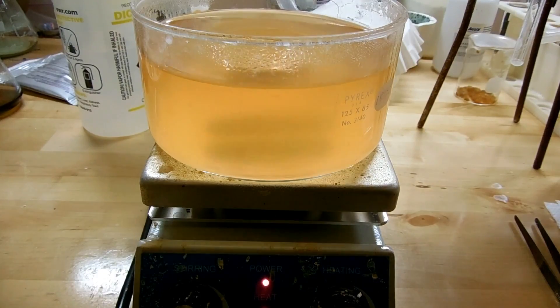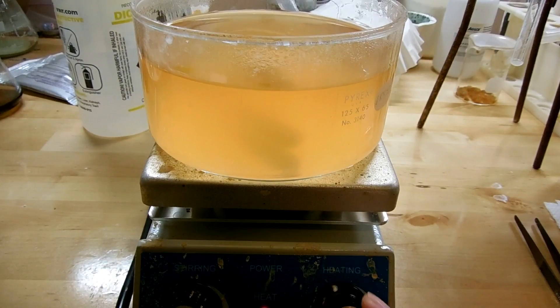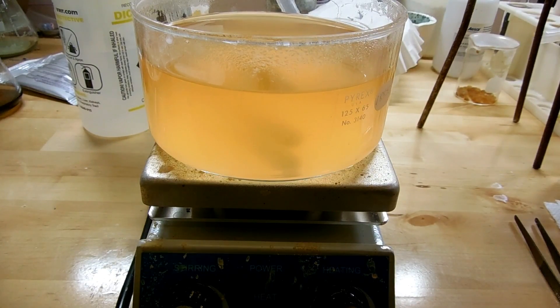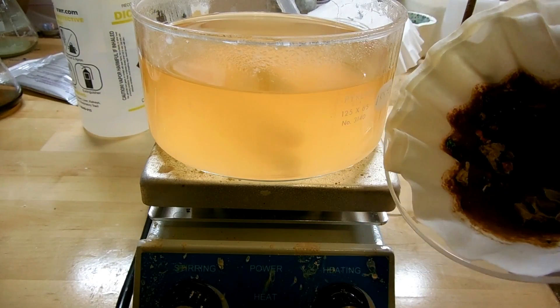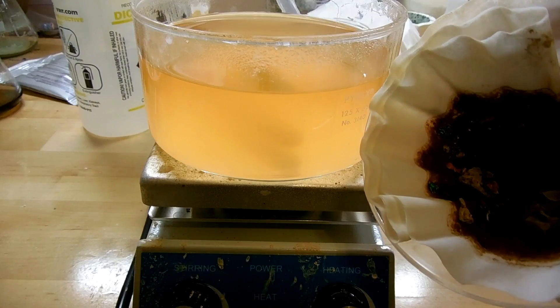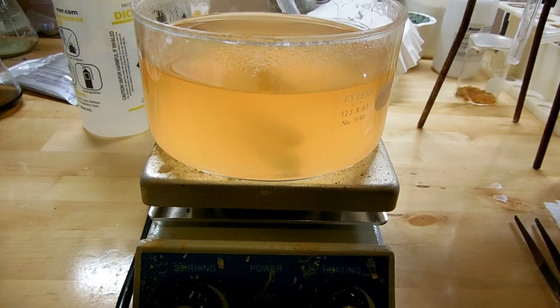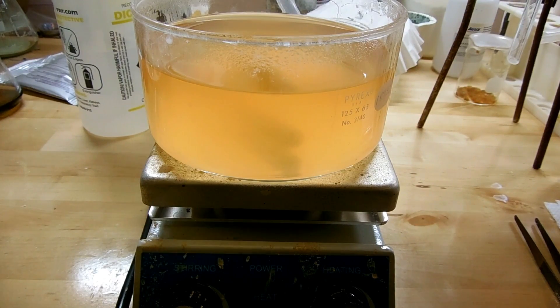Now that this is ready, I'm just going to turn off the stirring and the heat and let it cool down to precipitate the crystals. Here's the filter paper from when I first filtered everything — you can see all the gray material has now turned brown. I think that suggests that one of the impurities in the aluminum is iron, because it's been exposed to air and has rusted.